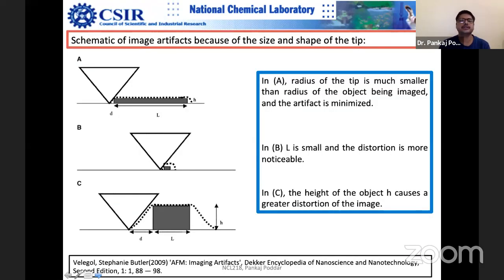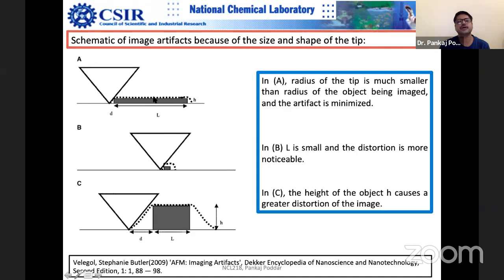The example shows: when the radius of the tip is much smaller than the radius of the object being imaged, the artifact is minimized. But if the object is much smaller than the tip radius, you see a significant amount of artifact. If the height of the object is much larger in comparison to the tip, you get sidewall effects. This happens most often for bacterial cells, which are quite large and rough, so you can imagine the sidewall interaction problem.